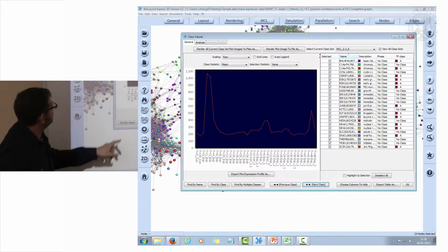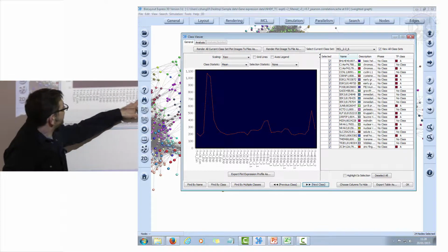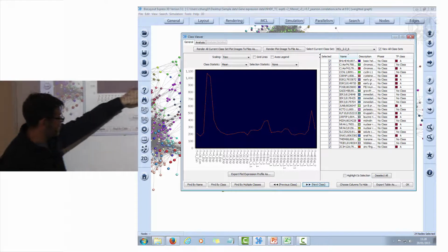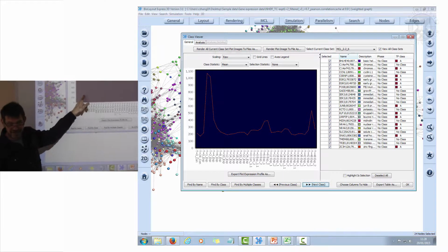This is a set of genes which, and again, it shows you the power of time courses. By 6 hours, these genes peak here in the second experiment, but the reason it only seems like a small bump is that these guys are actually up and down before 6 hours.